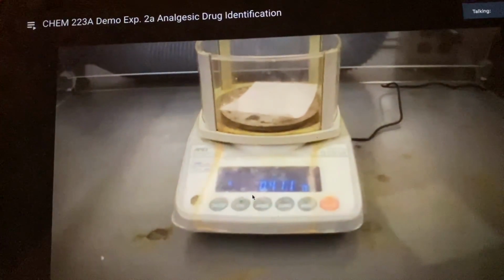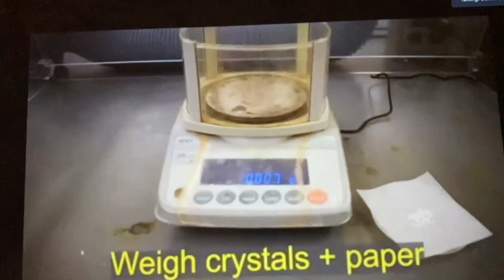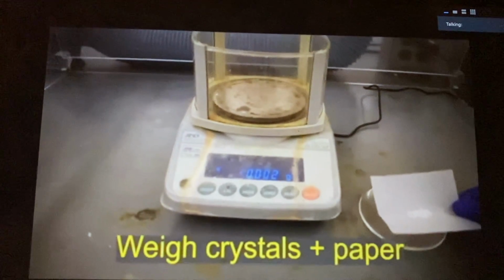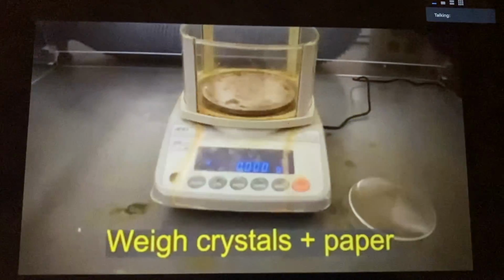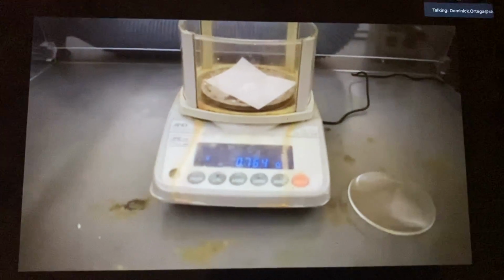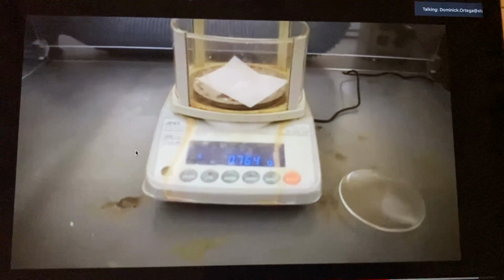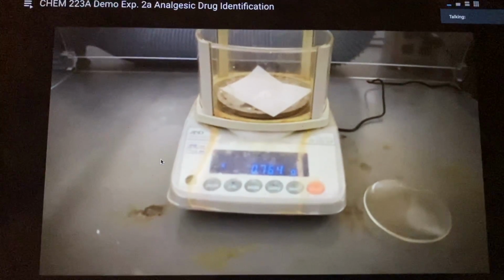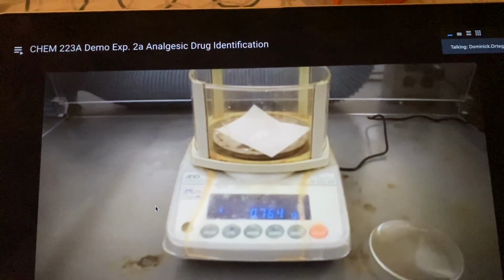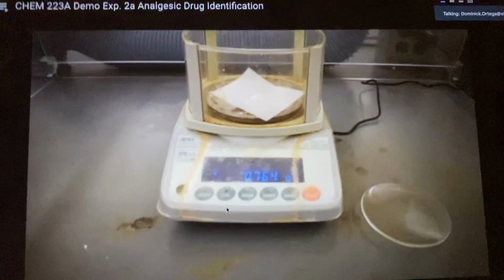And then when you add the filter paper plus the crystals, it's going to be 0.7 something, 0.711, I believe. 0.764 for the mass of the paper and the crystal. The paper was 0.410 or 411, and then with everything, it's 0.764. Did anybody not get those two numbers?